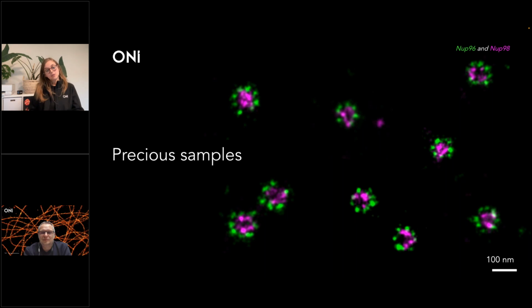And in the meanwhile, I want to ask you, how could I image bone marrow cells? I imagine these are very tricky cells to image. And how would I go ahead and prepare a sample for dSTORM? Prepare a sample from bone marrow.